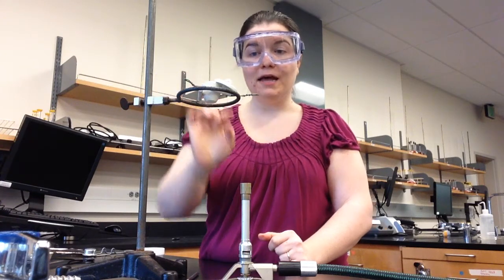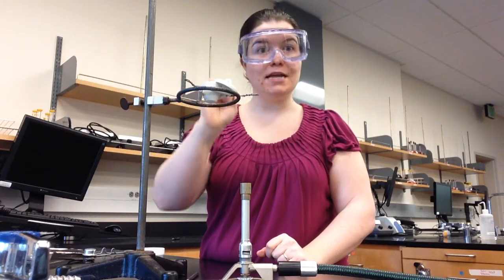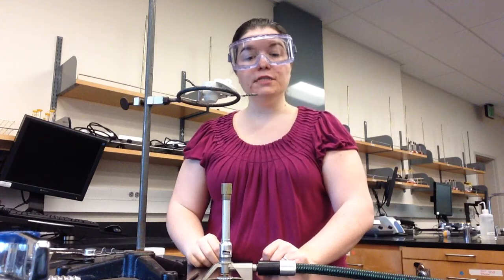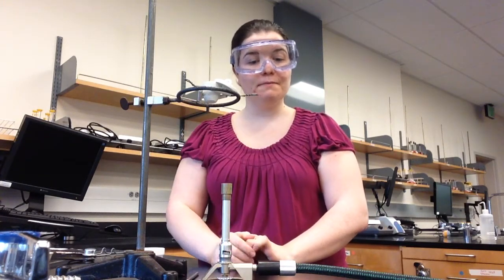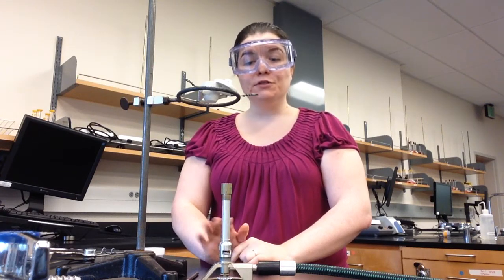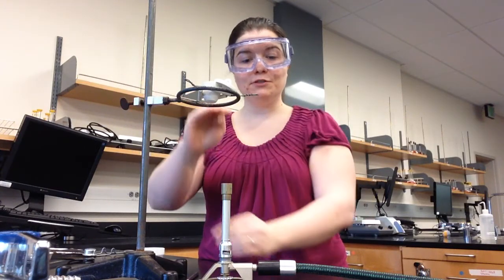on top of the crucible and the clay triangle, allowing air and oxygen to enter the crucible while you're heating it. You should heat the magnesium gently for 2 to 3 minutes at the top of the Bunsen burner flame, and wait for any chemical or physical changes to occur. If no changes occur after 2 to 3 minutes, you can turn off the Bunsen burner, lower the ring clamp and the crucible further into the Bunsen burner flame, and heat one more time, waiting for the chemical change to happen.